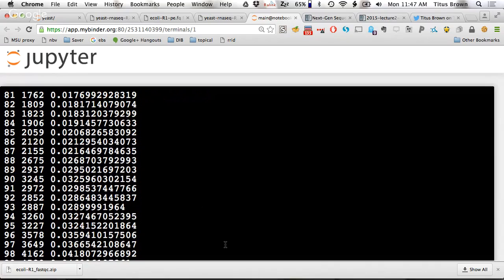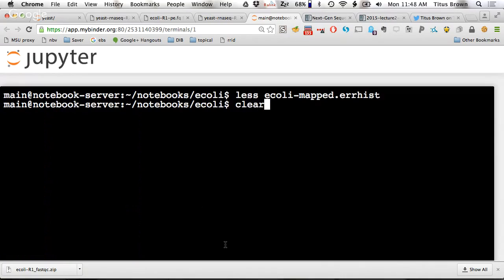And so this is an empirical statement about the frequency of errors with respect to position within the read, the frequency of mismatches. And again, the dominant explanation, by far the dominant explanation for this, barring other kinds of bias, is that these are errors that are occurring from the increasing rate of error as you sequence towards the 3' end of a read. Okay. Does that make some sense?